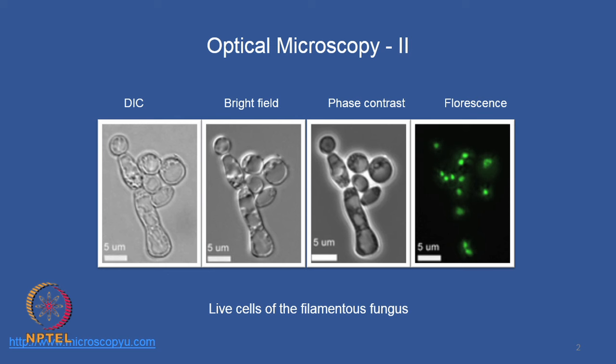I would like to begin by showing this slide. It's a very interesting slide taken from microscopyu.com. The very purpose of showing this slide is, if you look at this carefully, these images are taken from live cells of some fungus, and they are all at the same magnification, but you see the different types of contrast you obtain from different variants of this optical microscope.